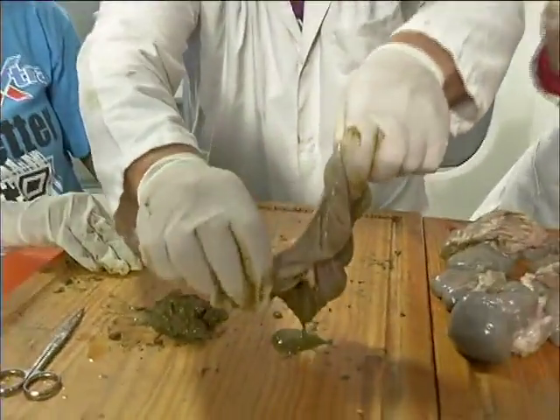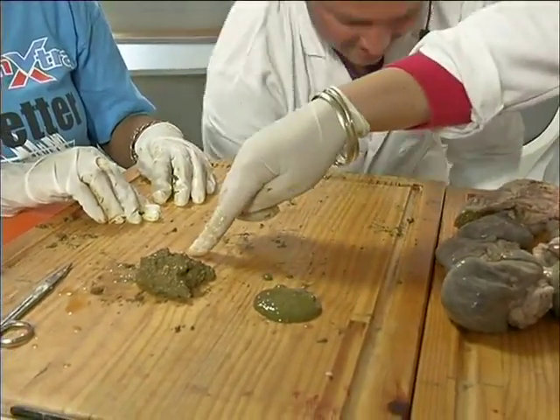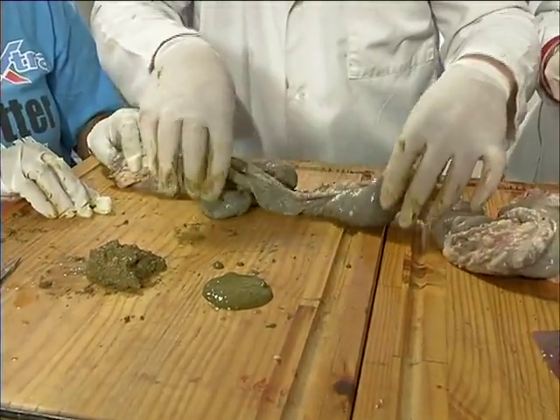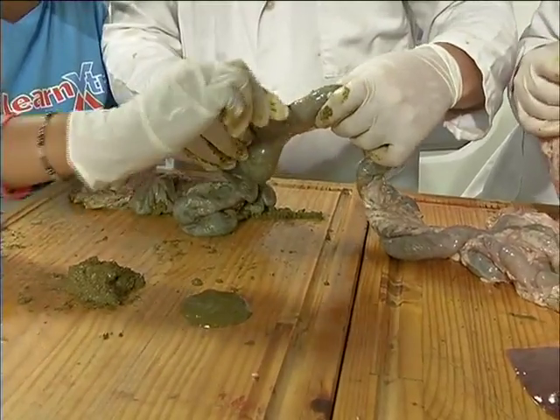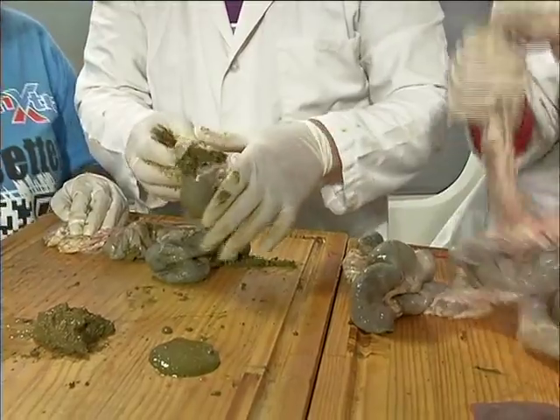If that's watery, that's not so watery, and then we've got some very not watery at the end here. Does that mean the water's disappearing? Is that what the large intestine's for? Exactly. The large intestine does absorption of water. Yeah, I should have remembered that.